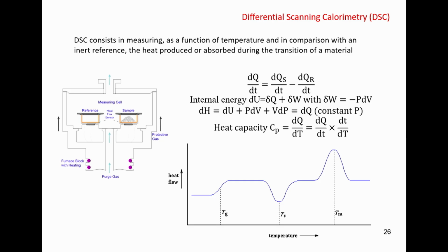We have a drop in this parameter. Here we have the derivative of the enthalpy because we are determining an enthalpy flow. And of course, if we have a drop in enthalpy, it means that we should have a peak on the derivative.